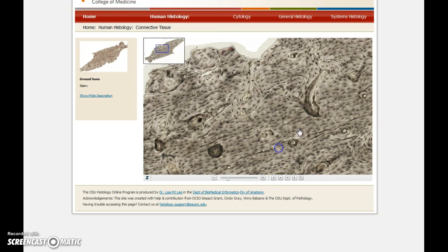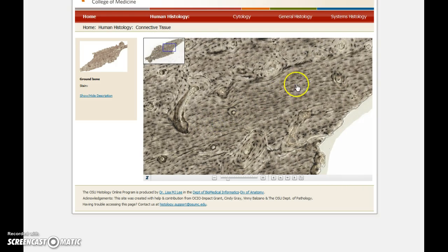These are called circumferential lamellae. These go all the way around the outside of the bone, and that is one of the structures that allows the bone to get wider. They're not concentric lamellae, they're circumferential lamellae. I hope this video helps you understand the histology of bone tissue.